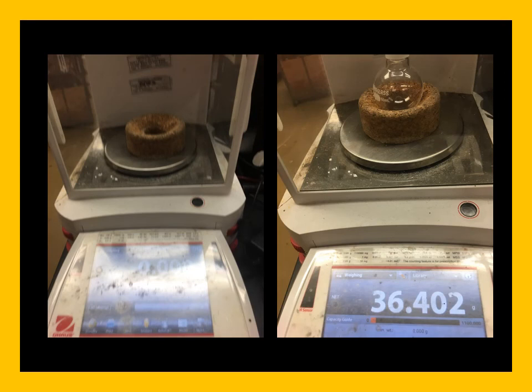And now I've tared a cork ring. I want to make sure that I have something to support my round bottom flask. And I've now obtained the weight of my round bottom flask. It's 36.402 grams. So make sure to note that in your notebook.